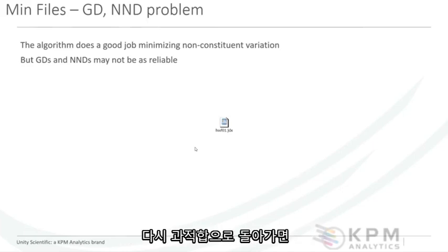And again, if we go back to overfitting and we talked about the PRESS plots and making your calibration stable and robust out in the real world, out in production, this is another case where the minimization file does the same thing. It will make your calibration less sensitive to, for example, temperature changes in your lab.